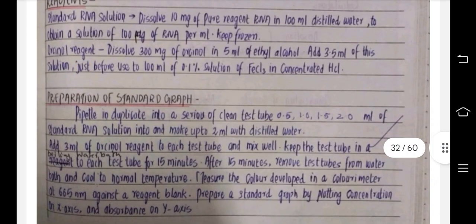Then preparation of standard graph. Pipette in duplicate into a series of clean test tubes 0.5, 1, 1.5, 2.0 ml of standard RNA solution and make up to 2 ml with distilled water. Then add 3 ml of Orcinol reagent to each test tube and mix well. Keep the test tubes in a boiling water bath for 15 minutes.